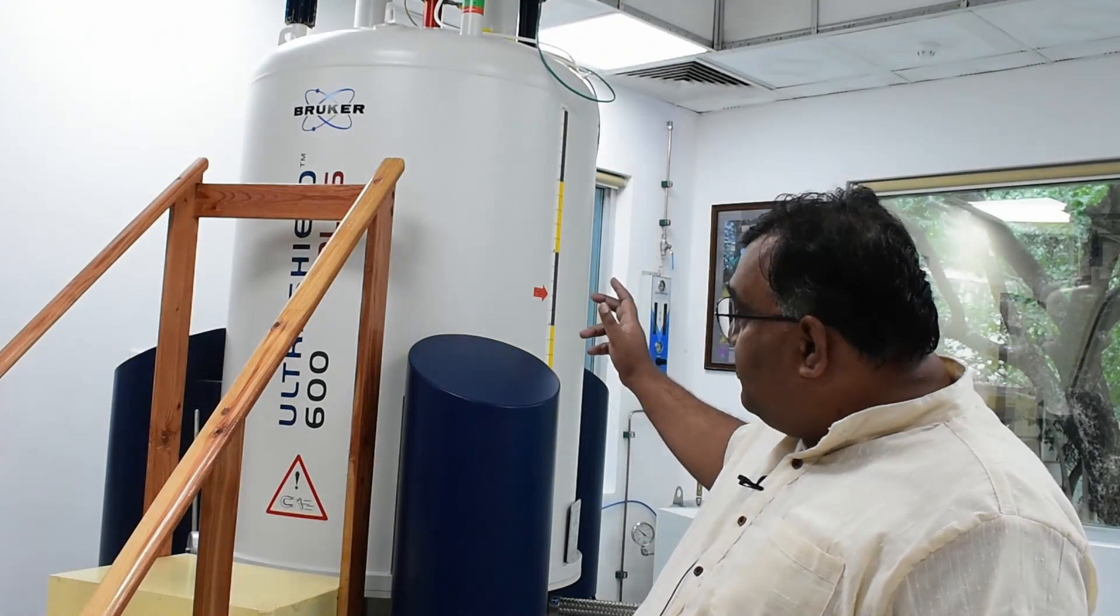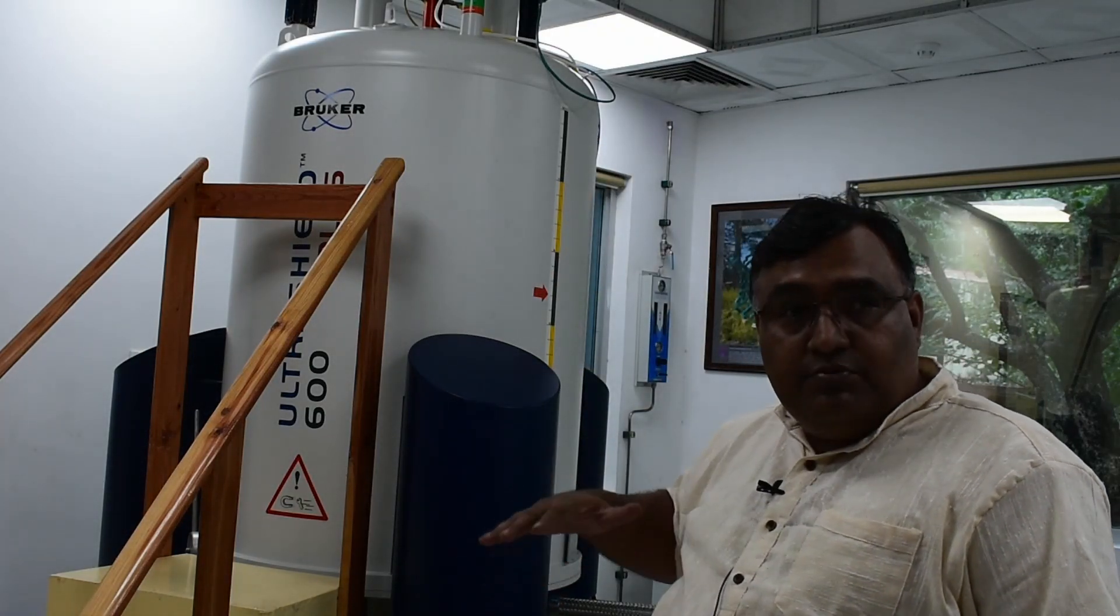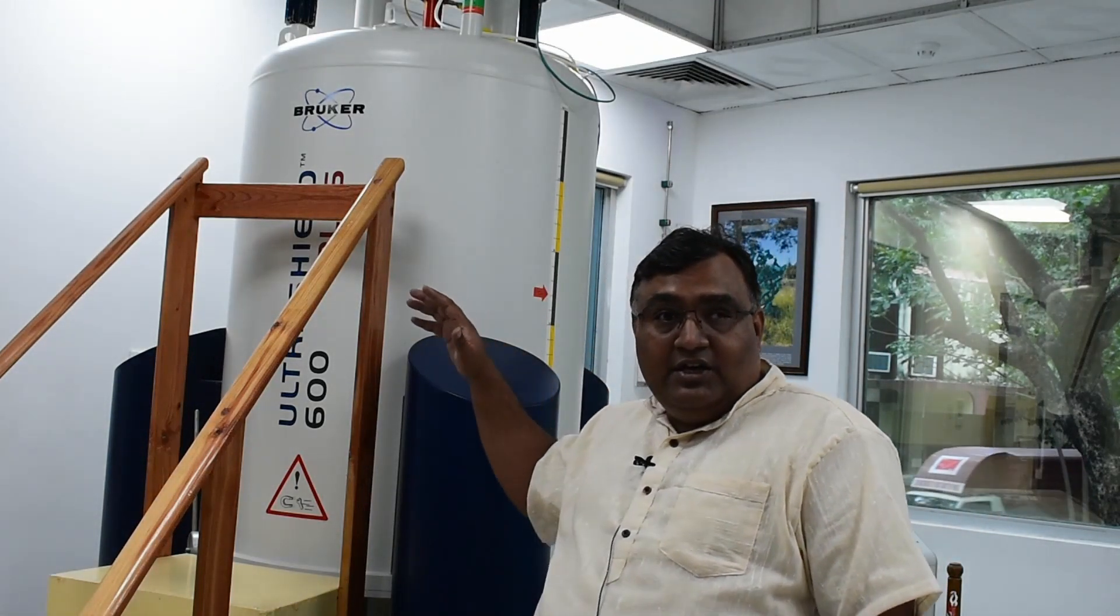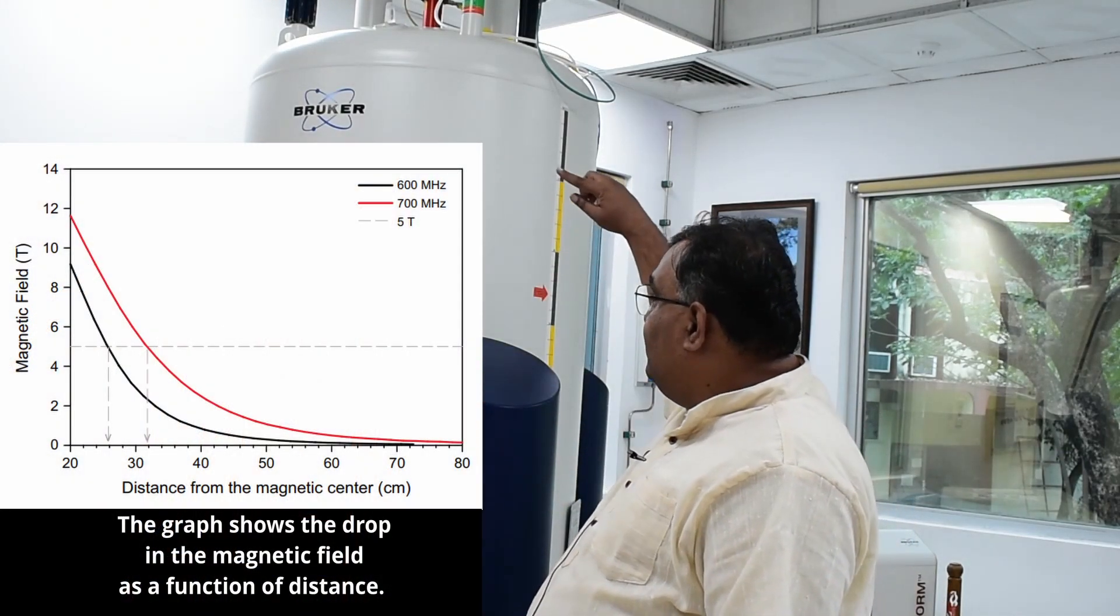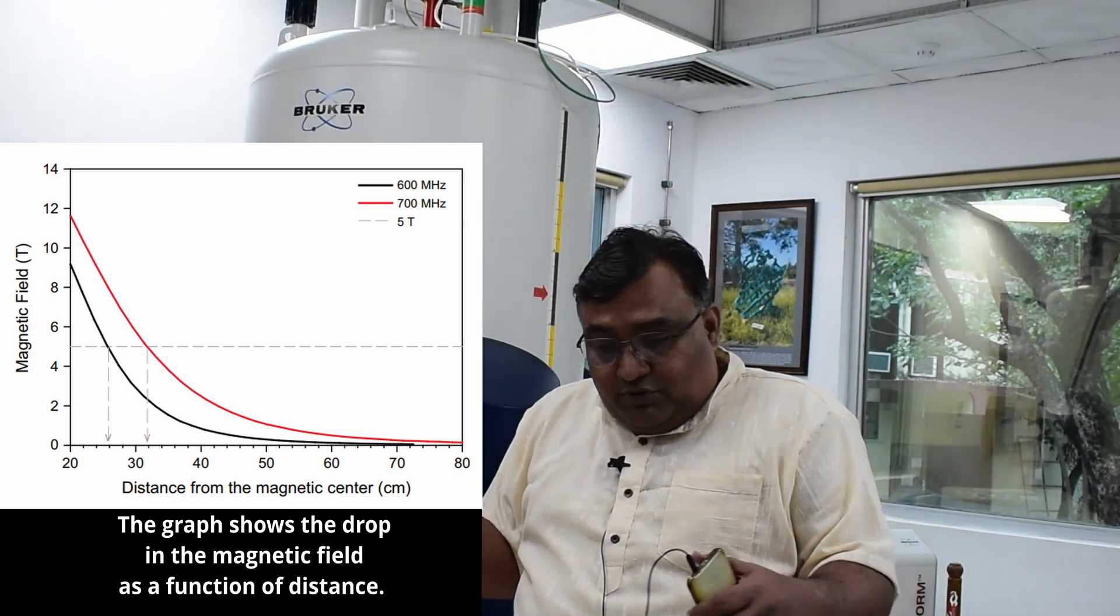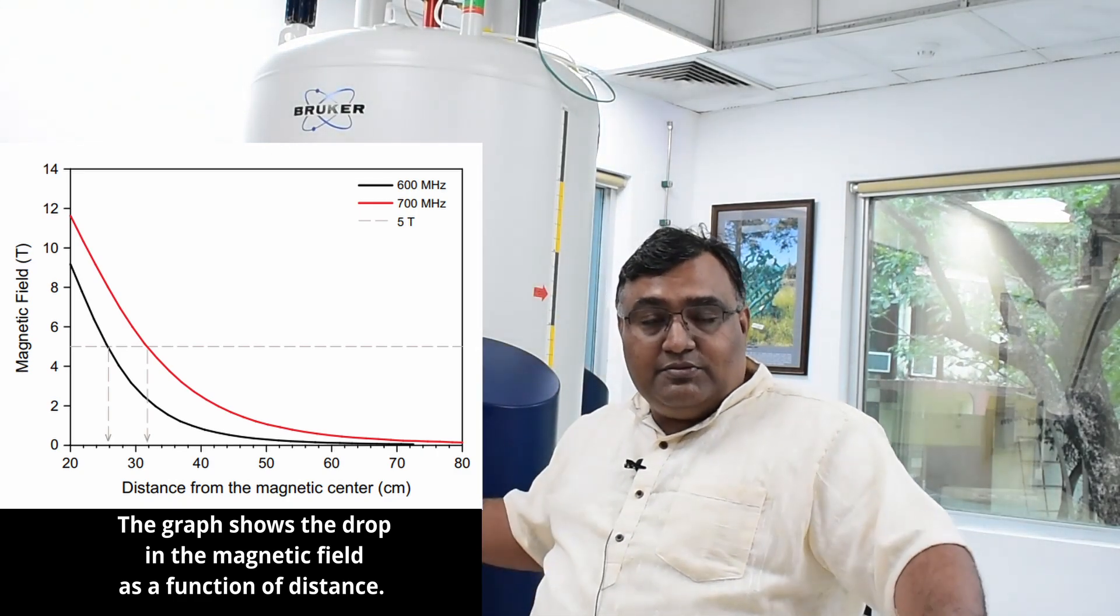Now the problem comes in that the fringe field of this magnet would be very high and I wouldn't be able to even stand here with this camera and a cell phone in my hand, had it not been ultra shielded or deshielded from the outer side. So there is an additional magnetic field that is created around this magnet from outside that essentially puts the fringe field to the legs of the magnet. And these are called as ultra shield magnets and that's why this magnet looks really big.